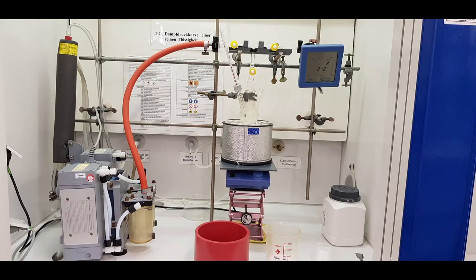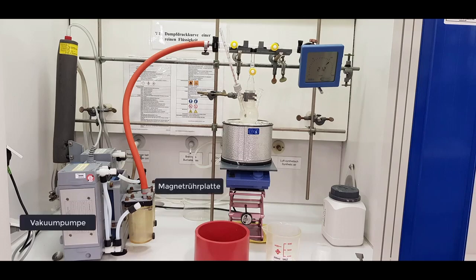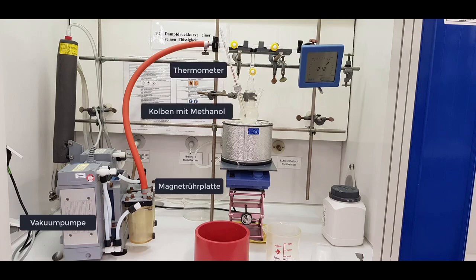The setup for this experiment consists of a vacuum pump, a magnetic stirrer, a three-necked round bottom flask with methanol and a magnetic stir bar, a thermometer, stopcocks for opening and closing, a manometer, and ice and salt.